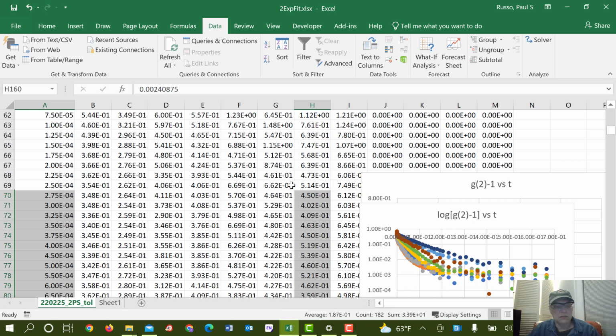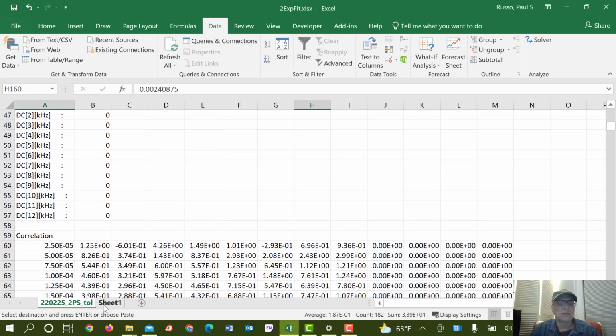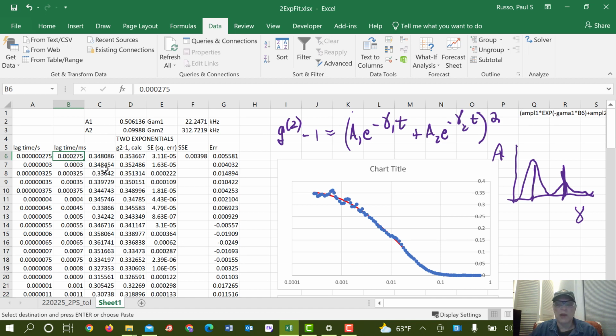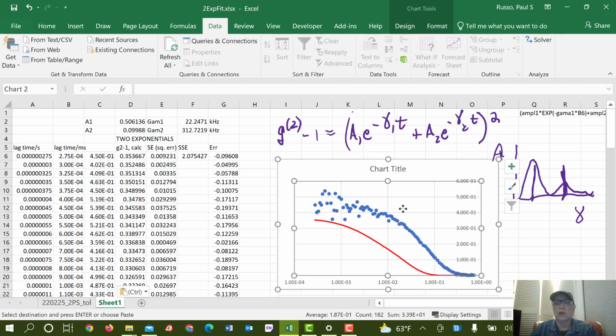And that. I don't know what happens if I paste those into here directly. Might make a mess. Let's see what happens. No, it seems like it worked okay. It put them where I wanted it to. Not surprisingly, we went to a lower angle, so the experimental data shifted to the right to longer times. Longer times mean longer distances means lower angles, so that all hangs together. I bet we don't have to change hardly anything else for this thing to work.